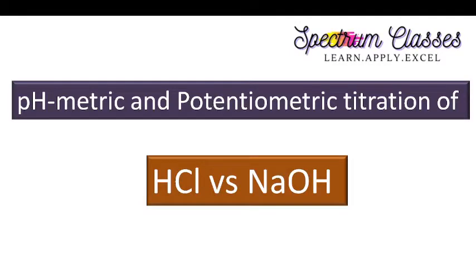Hello everyone, welcome back to Spectrum Classes. In this video I am going to show you the lab activity related to the pH metric titration of HCl versus NaOH, and in the same experiment we are also recording the potentiometric values of the titration. So let's start with the activity.